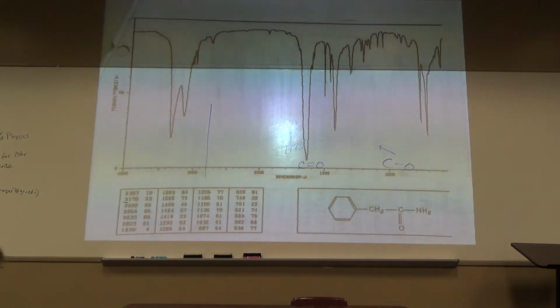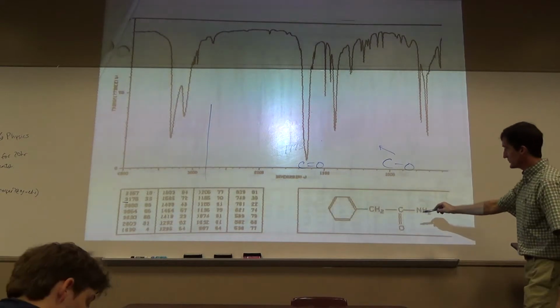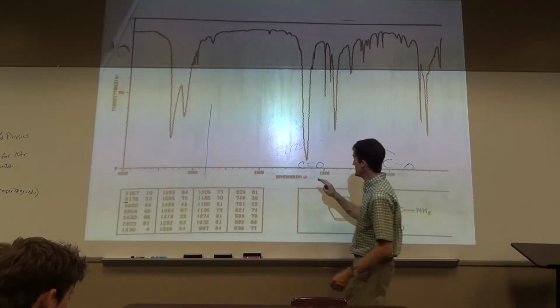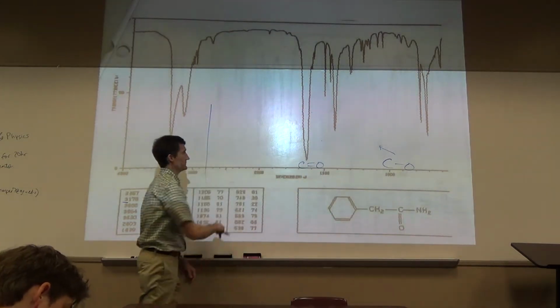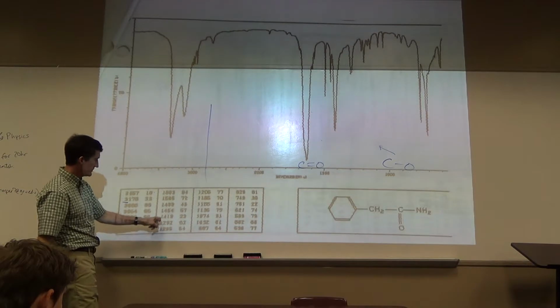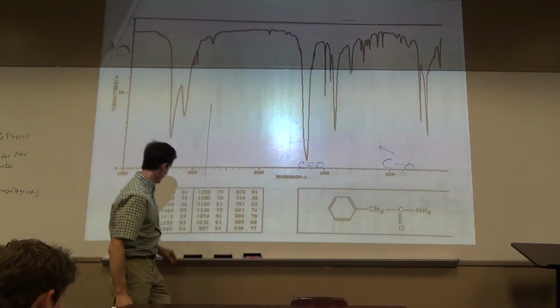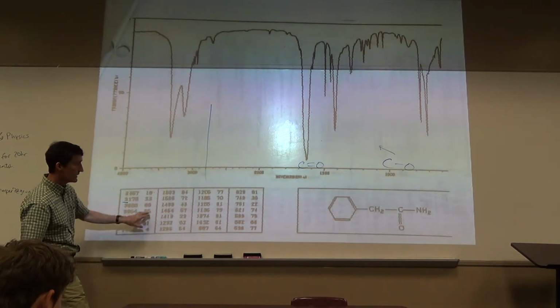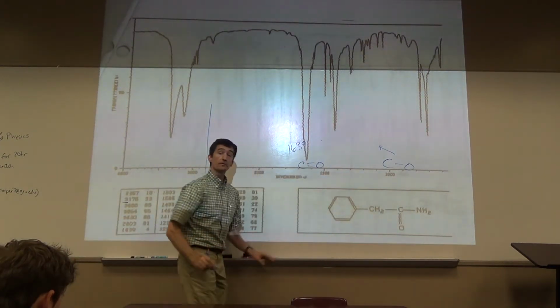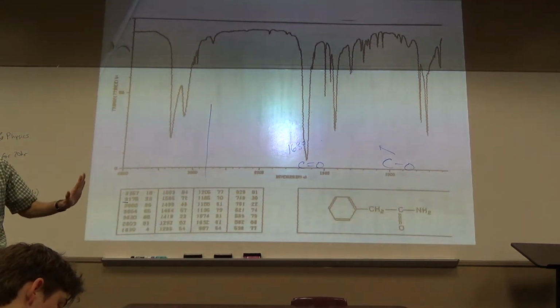I mean, at this point, we can sort of just plow on through and finish them up. We've seen most everything here. There's a couple of new things about the carbonyls. Carbonyl here, what do we see about this carbonyl position? What's the position? 1639. What is that compared to the others? Lower. Yes, amides give low carbonyls.